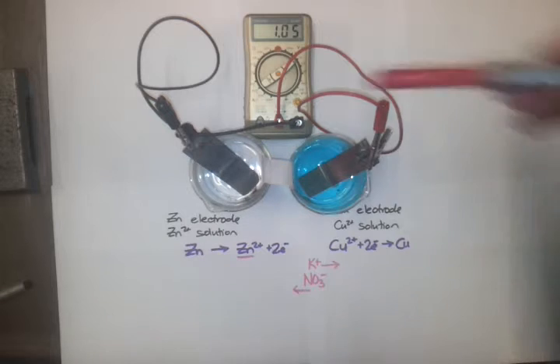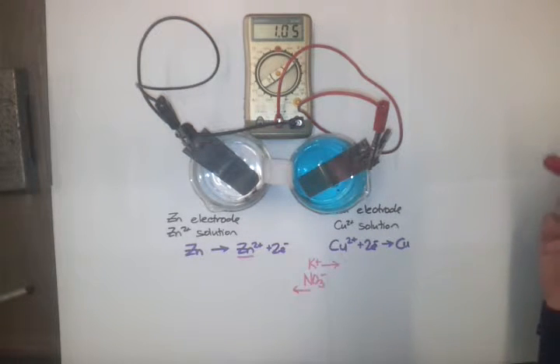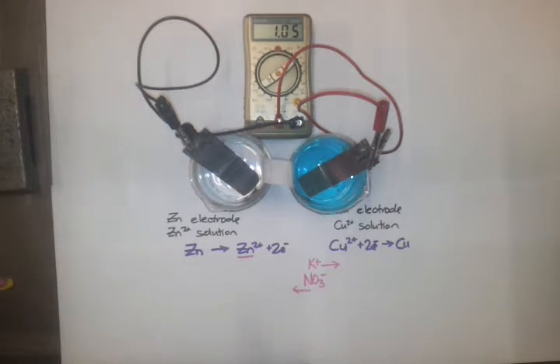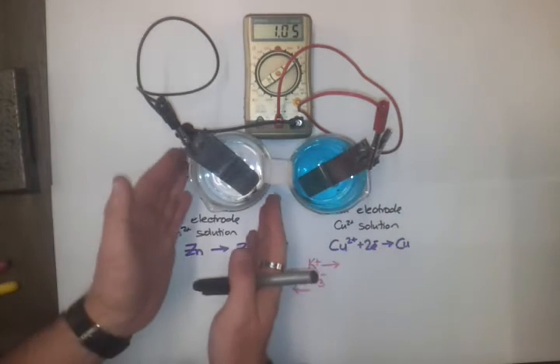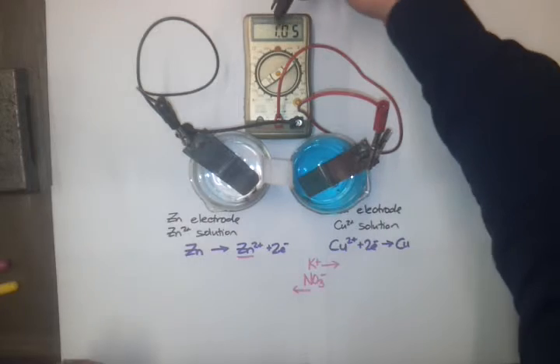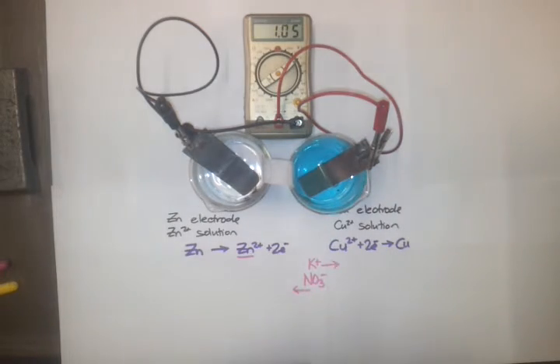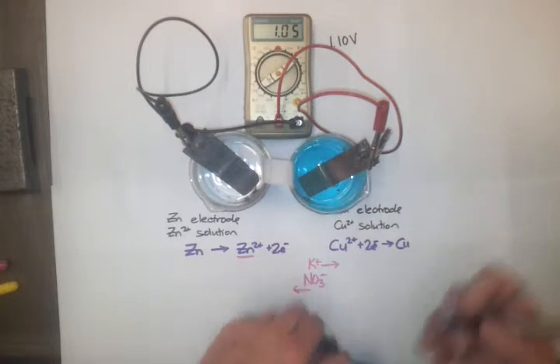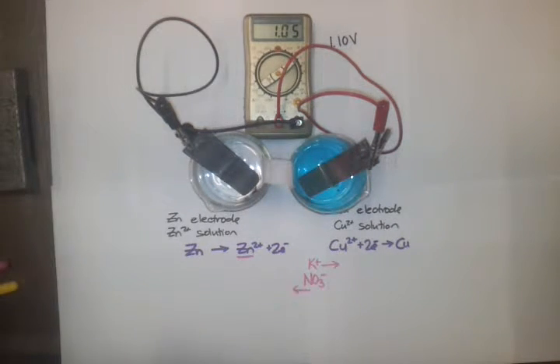Now just very quickly, this isn't really using any electrical power or energy. Setting up the multimeter as a voltmeter is measuring the potential difference between the two of them. This half cell has a potential to create a certain number of joules per coulomb, or volts, and so does this one. The two together have the potential as a completed cell to have 1.05 volts. Now the actual value for this, if we do it by mathematical reasons, is 1.10 volts, so we're getting a value a little bit lower than what we'd expect. That's not a surprise because we're not doing everything under standard conditions. That'll be talked about in another video.